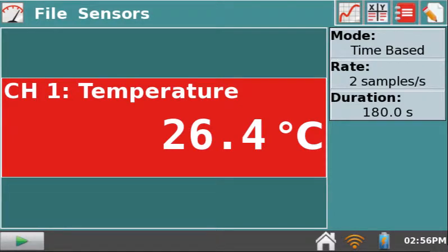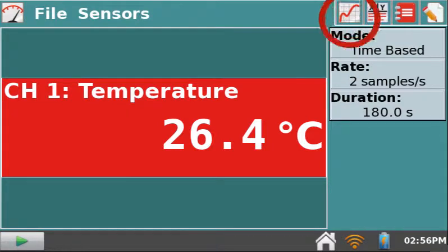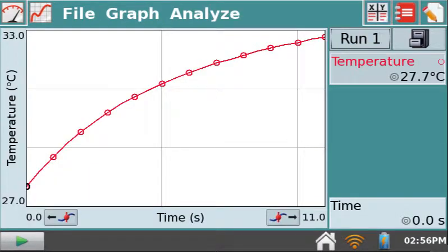Before you attempt to connect your iPad to a LabQuest 2, it can be helpful to already have collected some data. Now that we have the LabQuest 2 set up, let's work with the iPad.